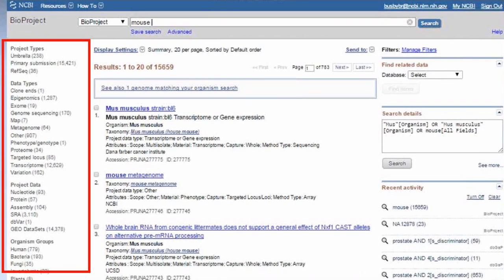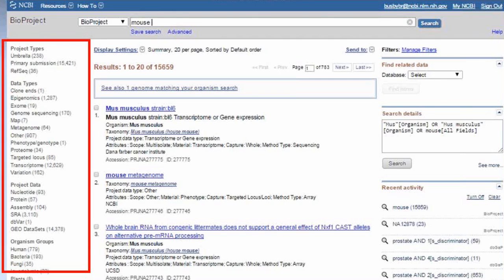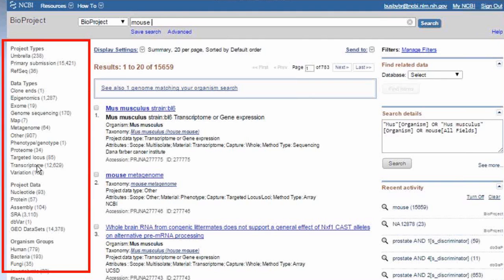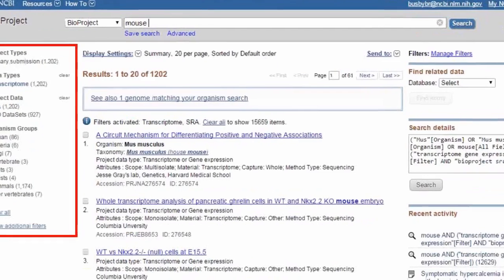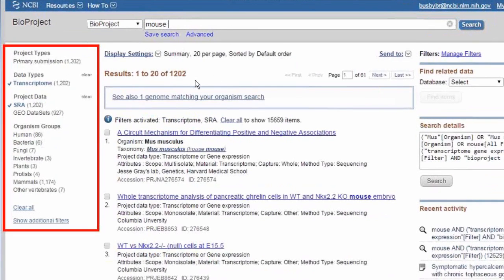If you were to search for a term like mouse or tuberculosis in the traditional Entrez search, you would get somewhere on the order of 8 million hits for mouse anyway. The advantage of using the BioProject database is that there is a faceted search bar on the left. For example, if I wanted RNA-seq data, I could facet by transcriptome and SRA. SRA is the Sequence Read Archive where we keep our next-generation sequencing data. And then that would specifically give me RNA-seq datasets for mouse.